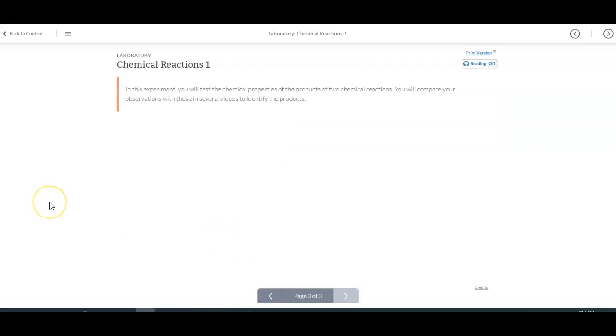So in the experiment, you will test the chemical properties of the products of two chemical reactions, and you're going to compare your observations with those in several videos to identify the products. So we're going to be shown a series of videos that give us something to base our comparison on coming up.